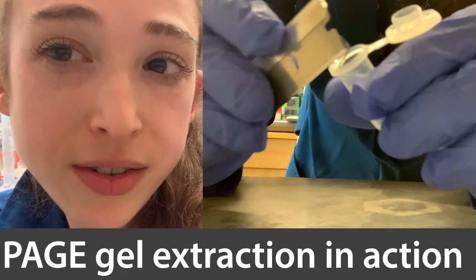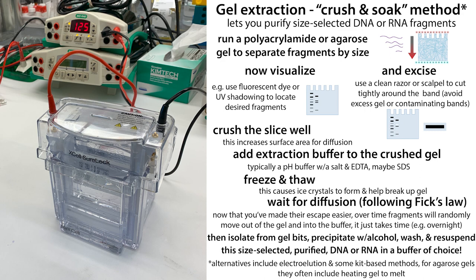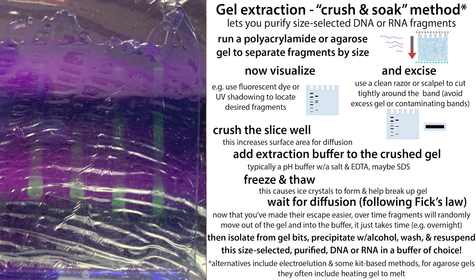Here's some practical advice for the gel purification or gel extraction of DNA or RNA using the crush-and-soak method, where basically what you do is use gel electrophoresis to separate DNA and RNA fragments by their size. Then you look and find the bands corresponding to those pieces that you want, and cut them out — but they're stuck in the gel.